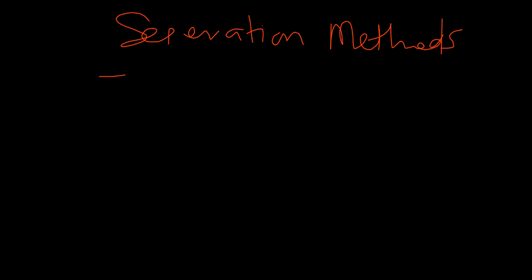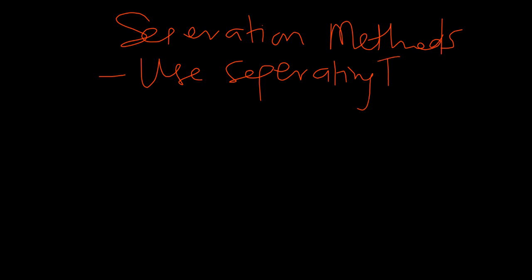In today's lesson, we'll still be looking at separation methods. However, we'll focus on just these two separation methods. So, one, looking at the use of separating funnels. Then we'll look at fractional distillation.